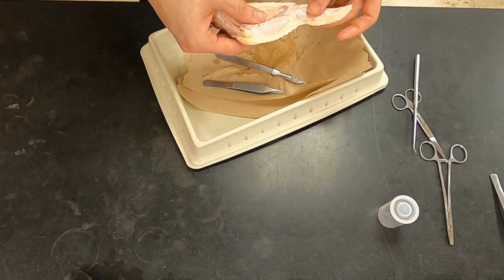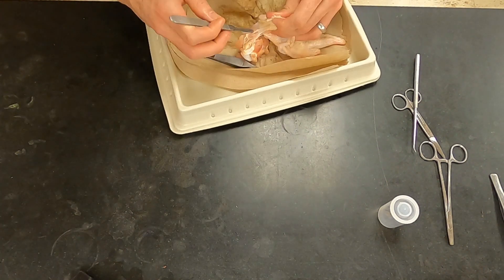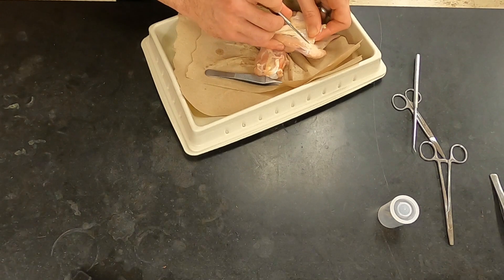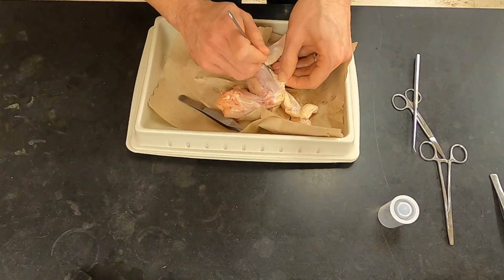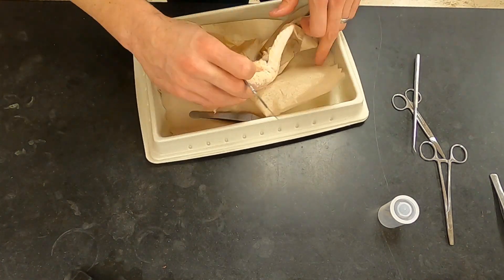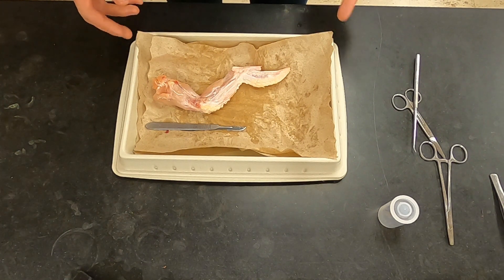We don't really need to focus on the distal part of the wing because we're focusing on the elbow joint. Now I've got the skin removed, and I'm going to start using my dull probe and my fingers to separate individual muscles so they can better be observed and identified.